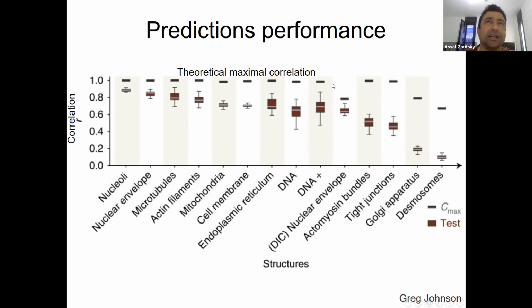And it was pretty cool how they did it. They took the noise within their system, within this dye. So each of these has a different fluorescent marker, right? Each fluorescent marker has its own noise and background intensities that are disturbing the prediction. So what they did, they added the noise based on what they know on the ground truth image, and they showed how well it can be reconstructed. And this gives an upper limit. So it shows what our current results are, but how we can still improve.